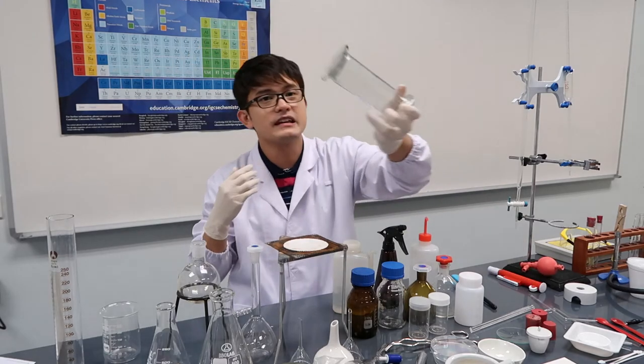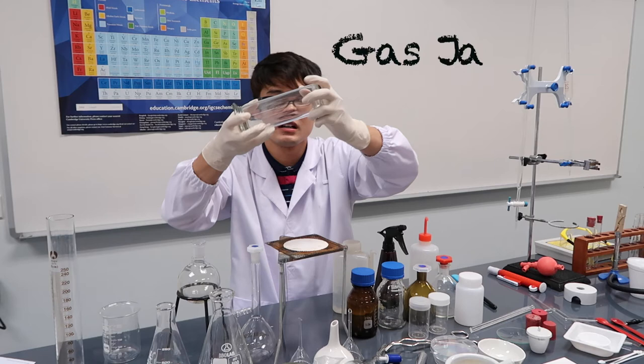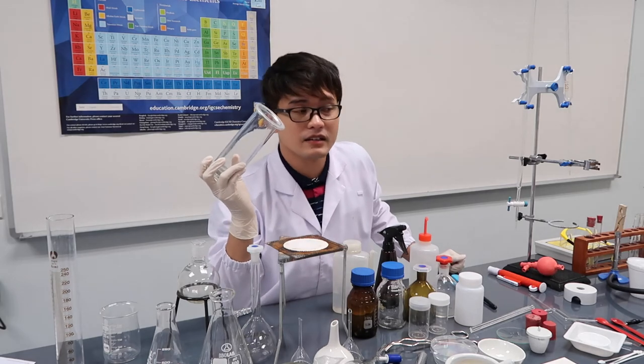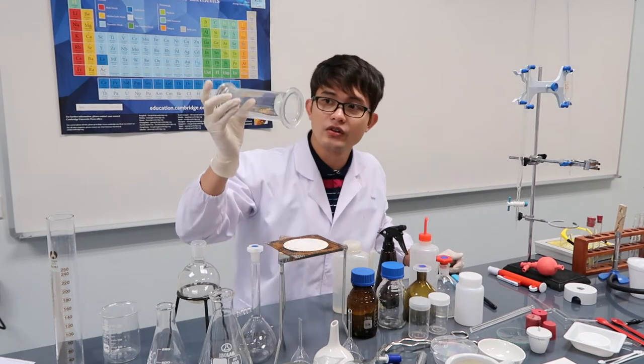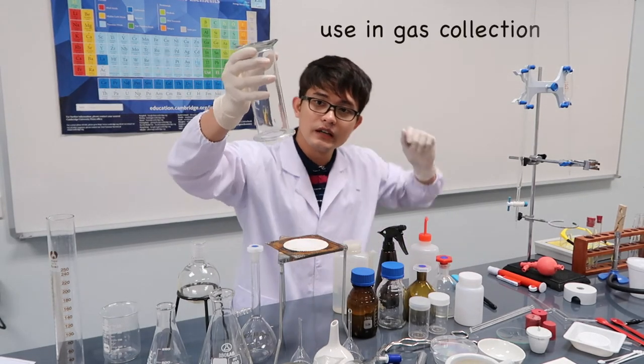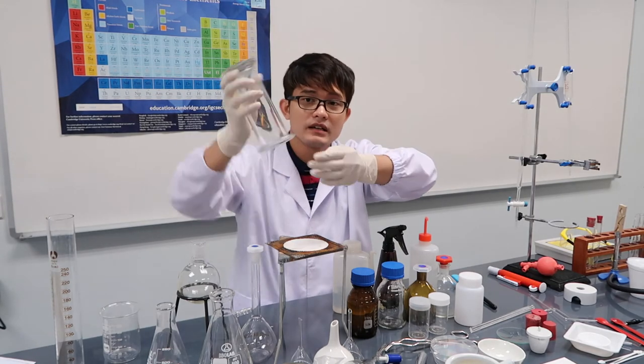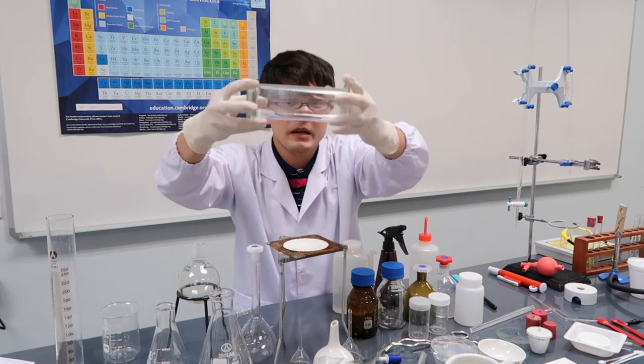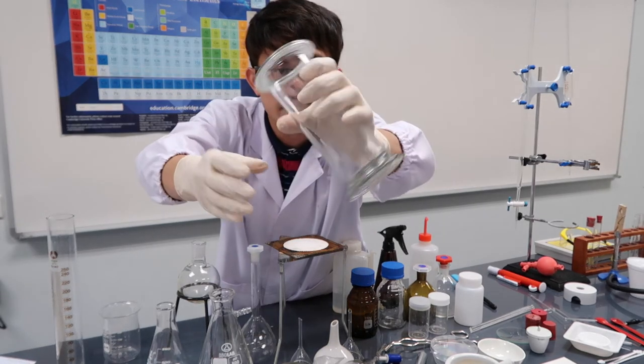This is a gas jar. There are experiments where you need to collect gas — this is what you use to collect it. You fill it with water, and in a certain experiment I'll show you later, this is what the gas jar looks like.